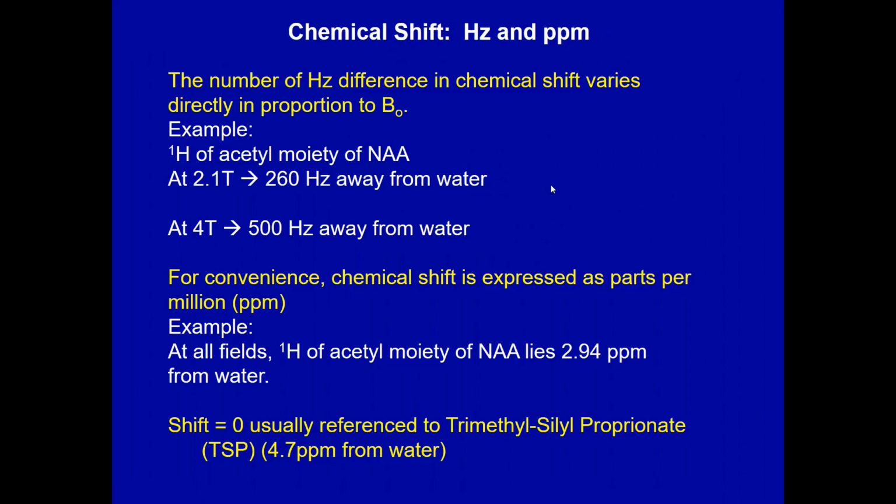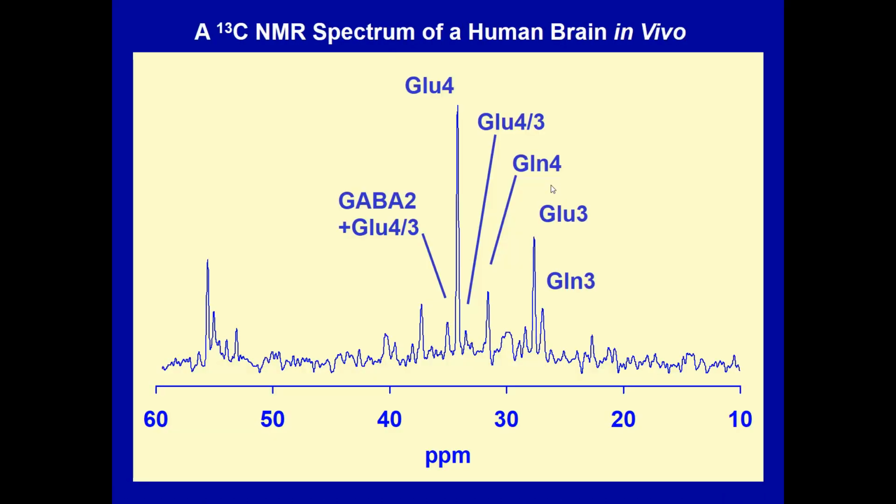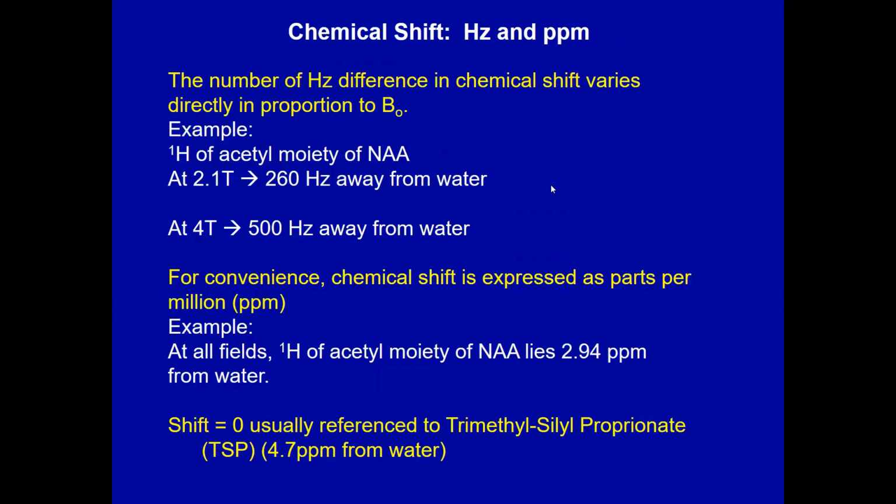Now, notice that the axis on there was parts per million. Robin discussed that in the initial lecture. That's hertz per million hertz. That's why parts per million. The first time I submitted a paper in psychiatry, the reviews came back, and this reviewer was used to parts per million representing concentrations of things, like maybe the amount of some pollutant in the air could be measured in parts per million. In this case, I explained it's something different, and the paper was accepted, and that was fine. In this case, we want to use it to help us understand each other.